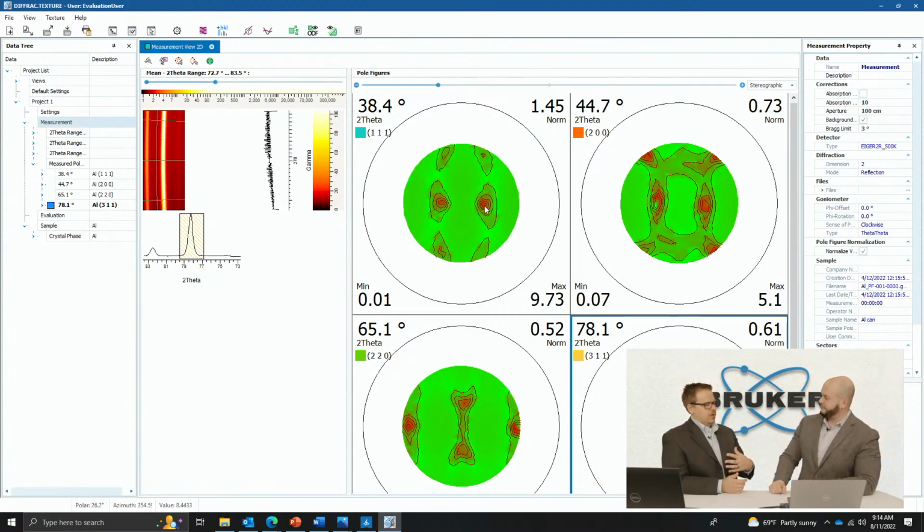Right. If this was a cube, I'm not sure if aluminum is a cube, but it's a face-centered cubic crystal. Oh, okay. Yeah, so it is a cube. So then when we see numbers like 1, 1, 1, what does that mean? So those are the reflections. So right, diffraction, you get the d-spacing between the planes, right? Okay, so it's the atomic plane.